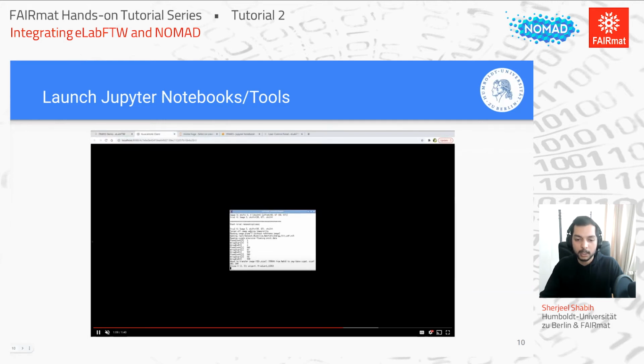those parameters, and now you see this is a terminal window, because this is a C++ application written to be executed from the command line. It opens up in a web browser window using the Guacamole client. This is similar to what a VNC would do, where you really route the display out to another computer. So the server is providing some desktop environment that you're just viewing in your browser using remote desktop technology.